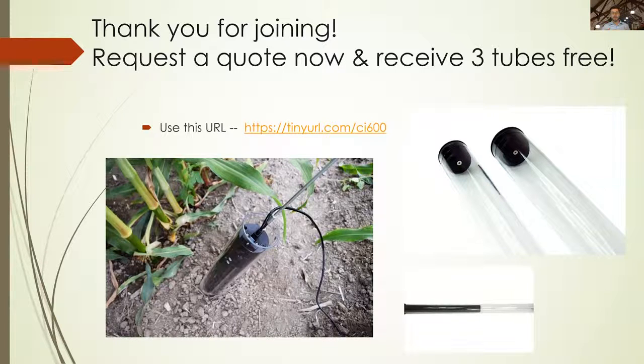Now, since these are acrylic tubes, they are fairly resilient, but the next question is dealing with them deforming below ground. And the answer is anything. There's very little in the way of a clear tube that can't deform below ground at this point if you're giving it the right conditions, like flooding the ground or a lot of pressure. But the biggest thing I find is the initial installation really dictates how well that tube is going to perform as you're using the scanner on it. Usually after being installed and after it's settled and the roots have grown around it, those tubes are pretty much good to go for the long haul, for many years of study.